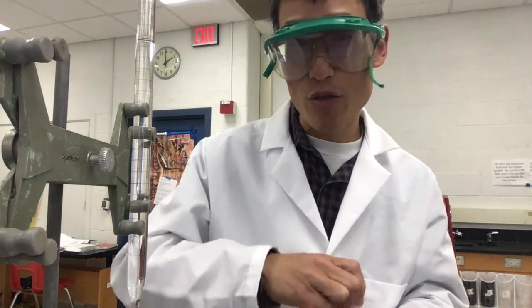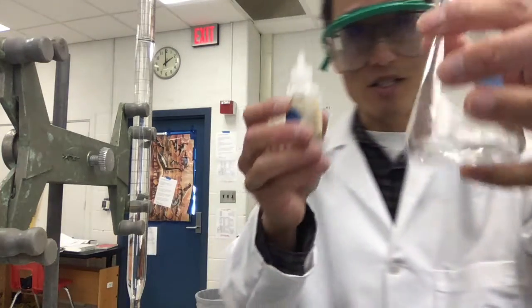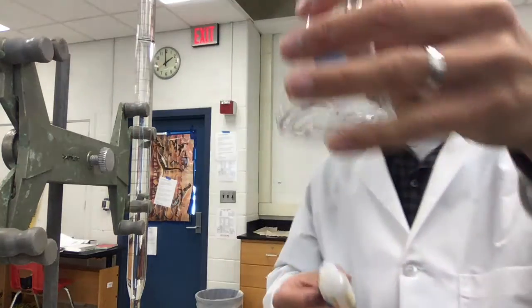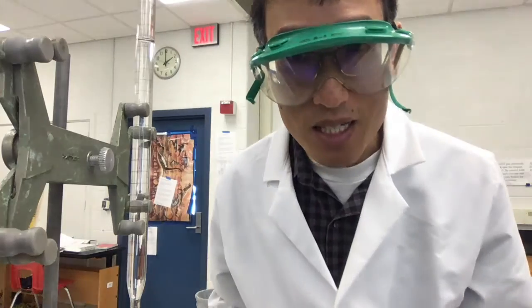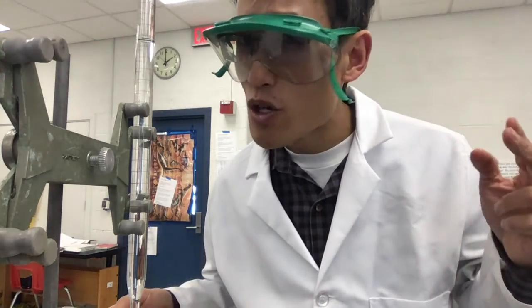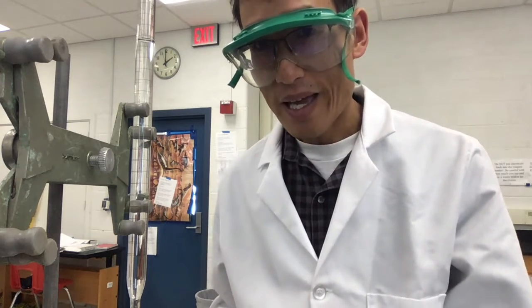We're going to put about 2 to 3 drops of phenolphthalein into here. So this is my acid. I'm going to put a couple drops in here. You can't see anything right now, but phenolphthalein is clear in acidic solution. However, it turns pink when it is a basic solution or around neutral. So once it gets to about neutral, it'll turn pink. And that's what we're going to look for.